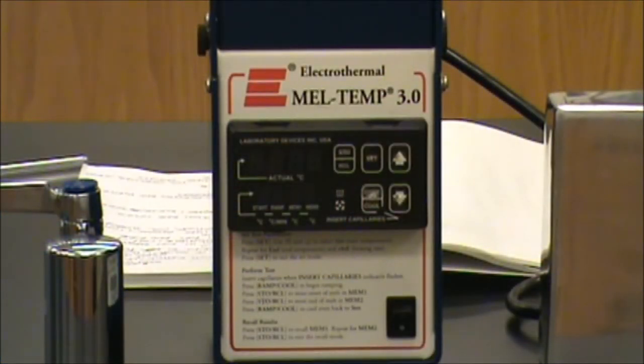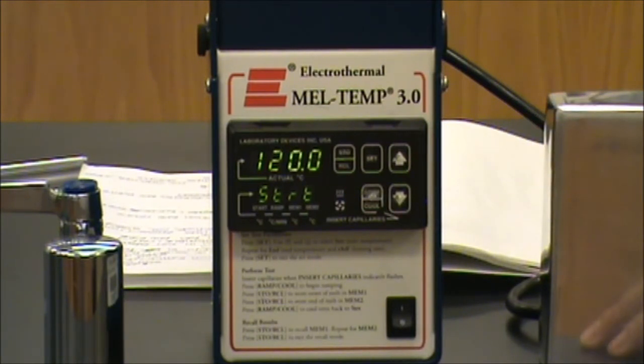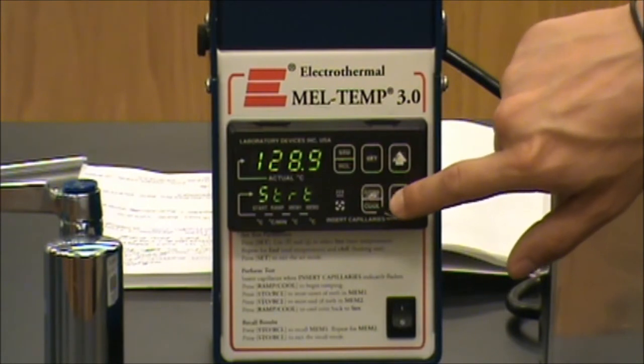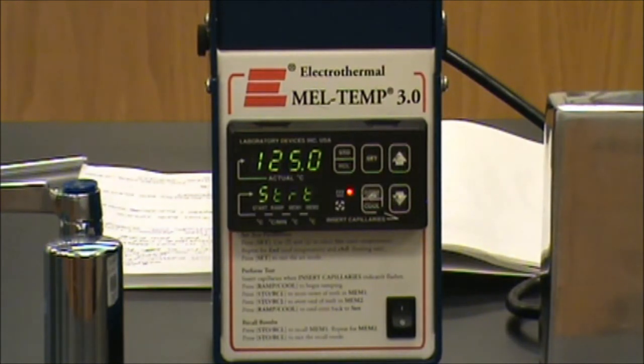In order to use the melting point apparatus, we must first turn it on using the switch at the lower right of the instrument. Once this instrument powers up, we must program it. We do this using the set button located top center on the display. In order to change our start temperature, you use the up and down arrows. You want to select a temperature that's at least 25 degrees lower than the expected melting point of your compound. I've set this for a temperature of 125 degrees to start.